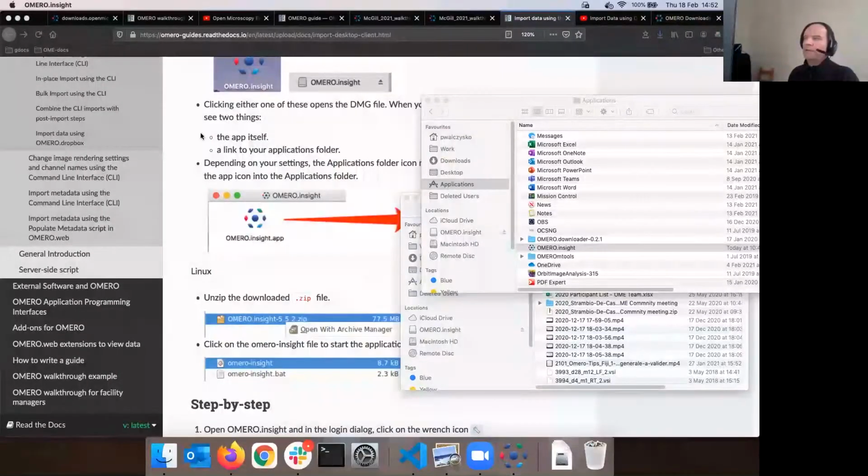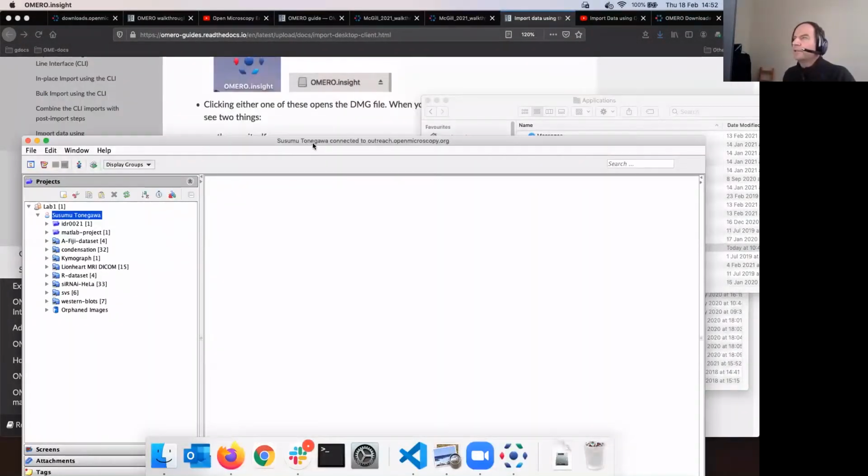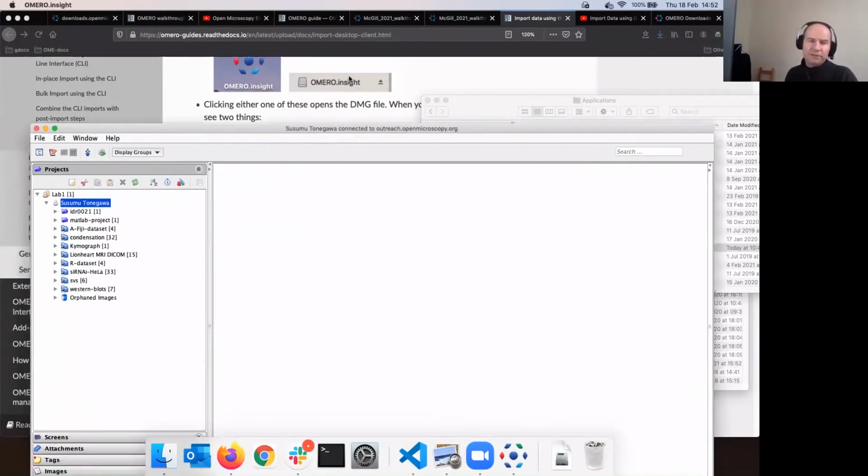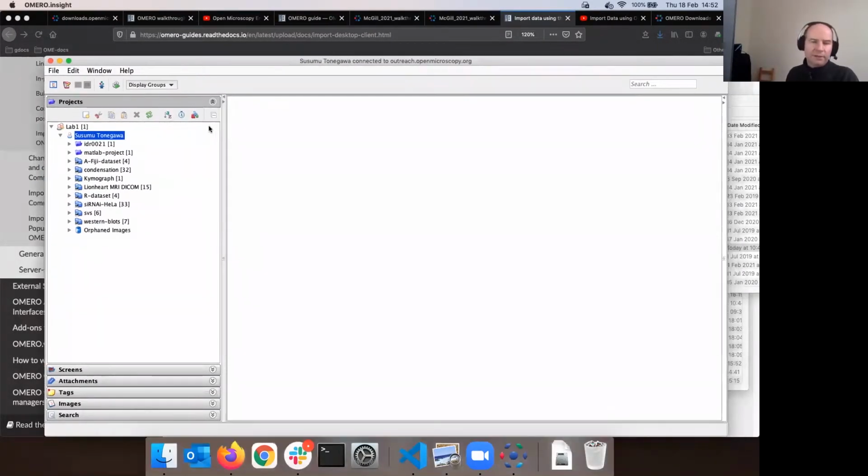Okay, now I know that I'm user 49, but it says that it's Tonegawa here, okay? So that might be something which is completely confusing you, and don't be confused by that, just live with that. I will explain that in a second when we go to OMERO Web, okay?